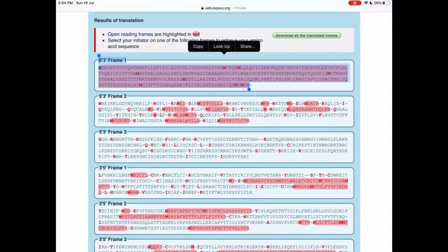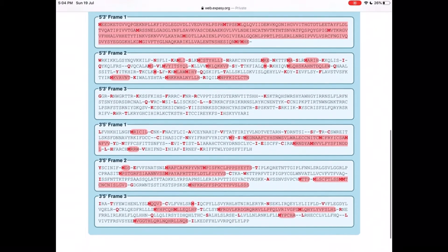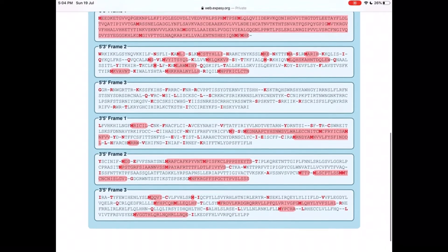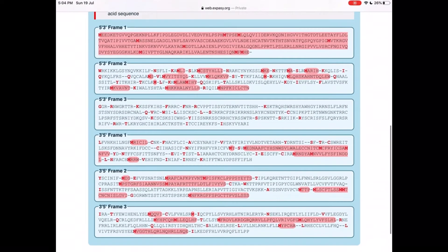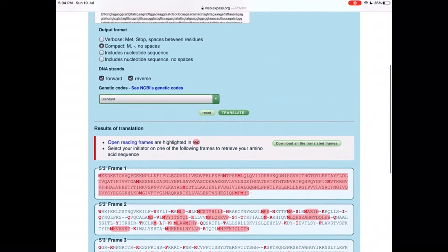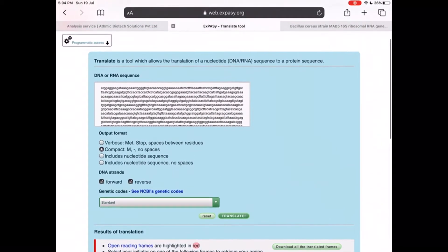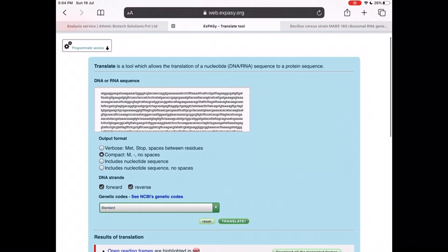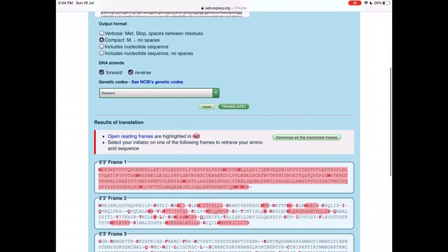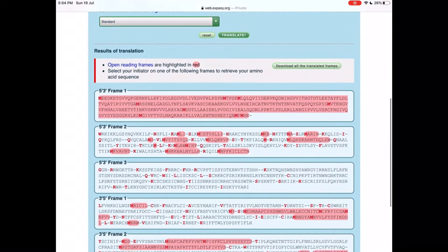The nucleotide sequence that we have given will be translated into all six possible reading frames. We can see that the continuous reading frame is on 5' to 3', frame 1.